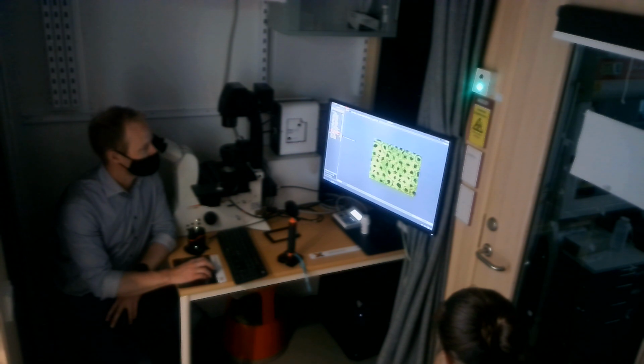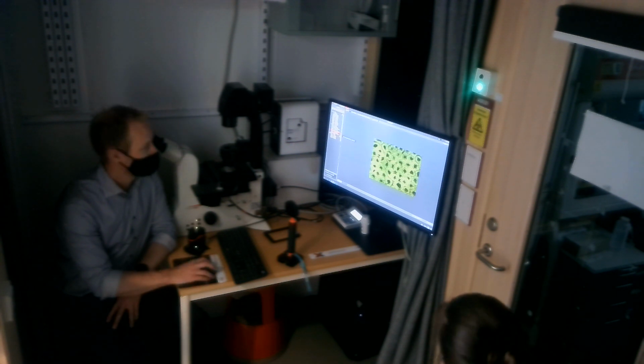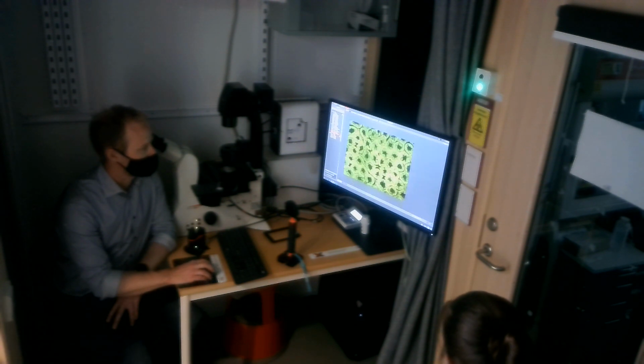And if we go to the merge, it creates automatically because I asked it to stitch while acquiring. If we go to that one, it has merged them together. So now this one is in better shape.